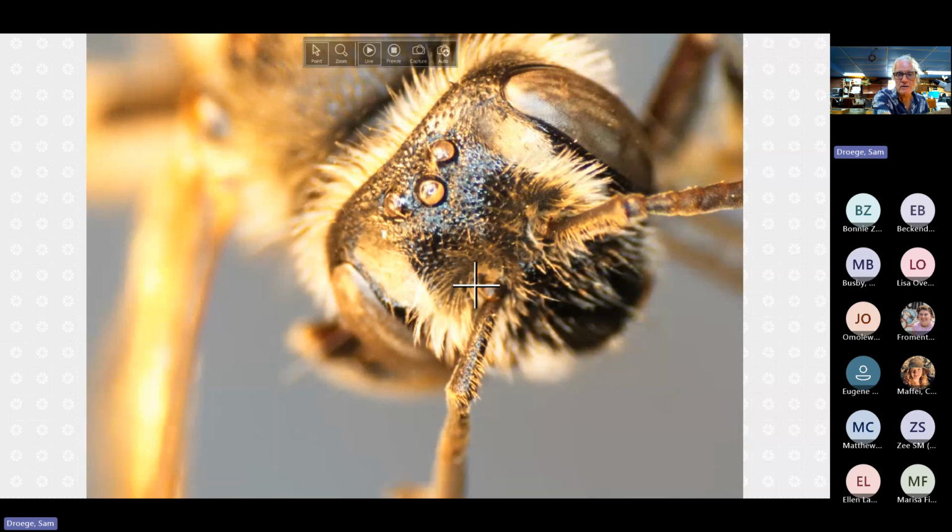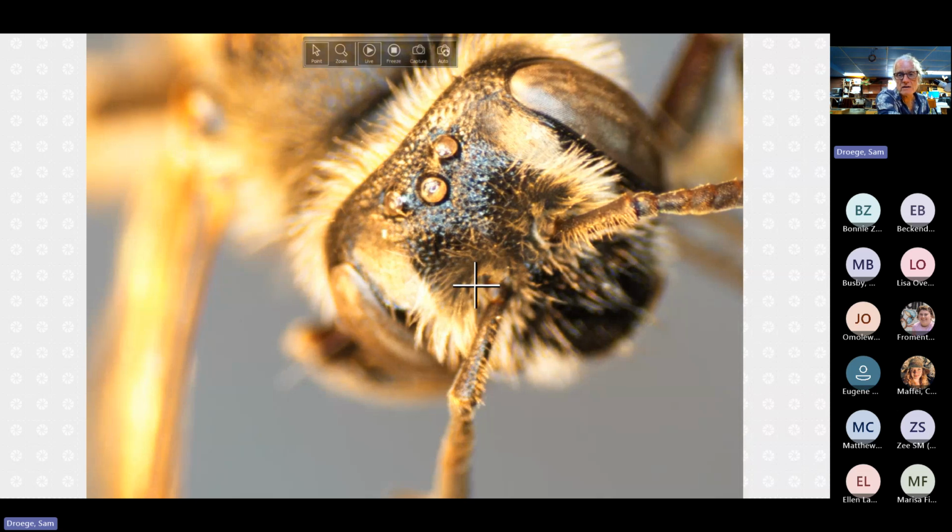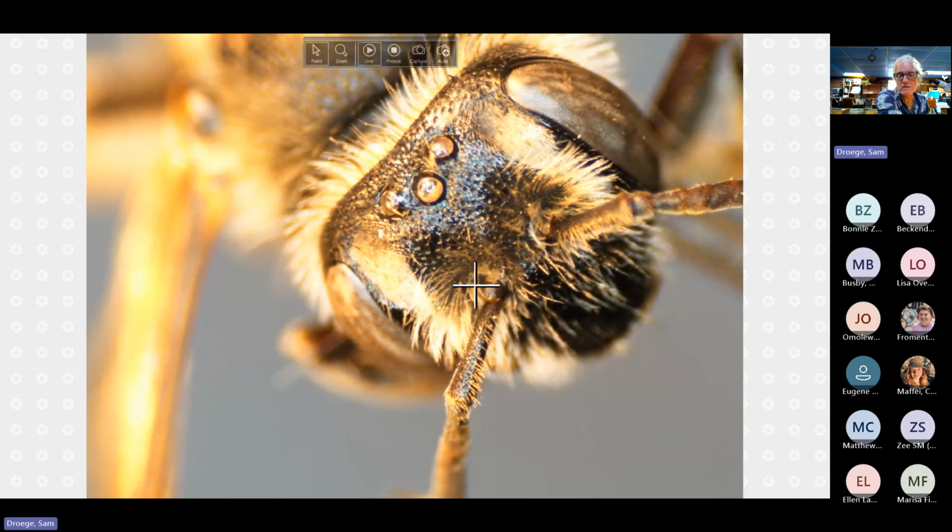And again, we have the often tricky problem of seeing the lower part on these kinds of microscope lenses because of these hairs, but you can see this very easily under the microscope. So this area, the width of the lower part to the width of the upper part at their greatest and narrowest, you can see roughly 2 times difference, 2.5 maybe.